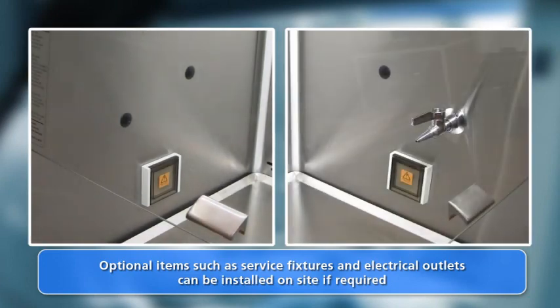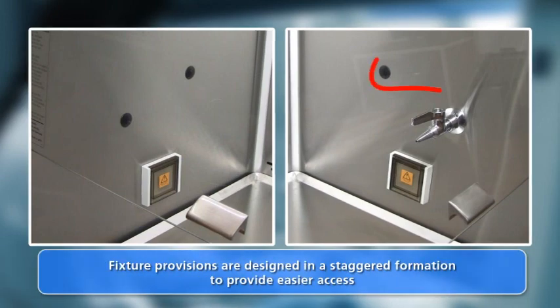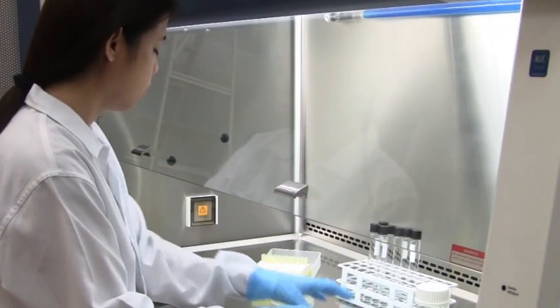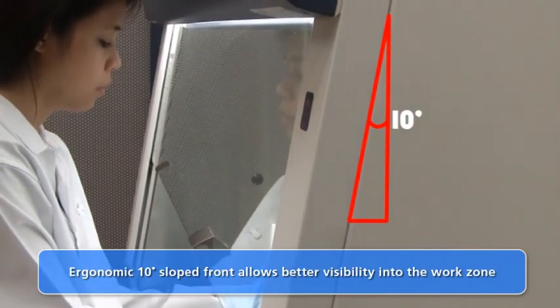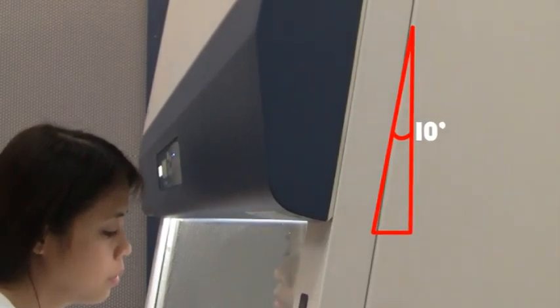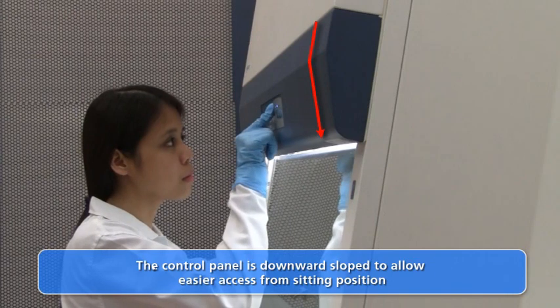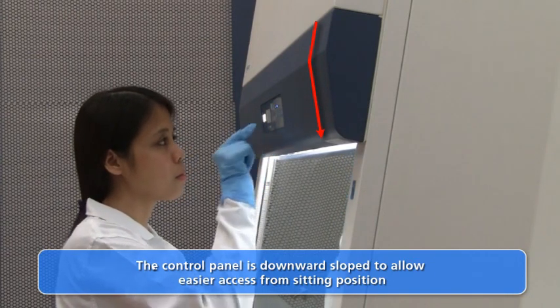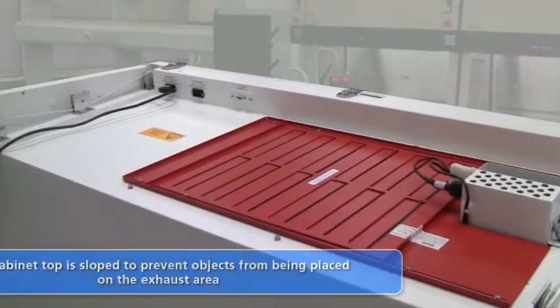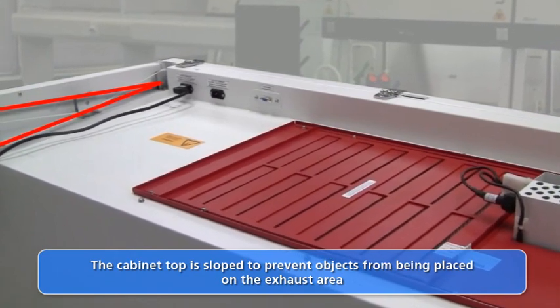All cabinet provisions are pre-fitted with the user in mind. For example, the service fixture provisions are staggered in order to provide easier access to both service fixtures. The cabinet is designed with a 10-degree sloped front which provides better visibility into the work zone. The microprocessor control panel is downward sloped for easier access to the control buttons from a sitting position. The cabinet exhaust filter area is also designed with a slope to prevent loose objects from obstructing the exhaust airflow.